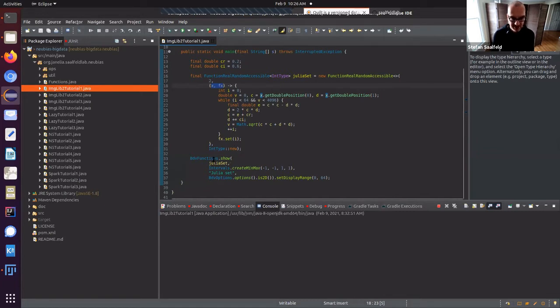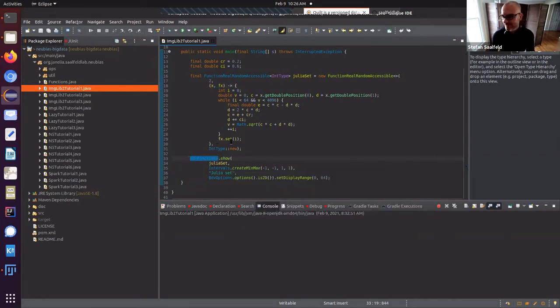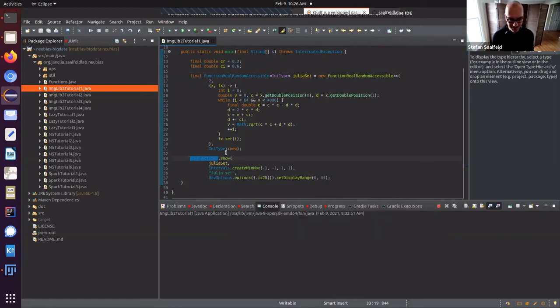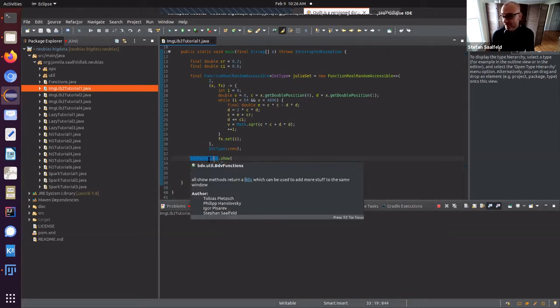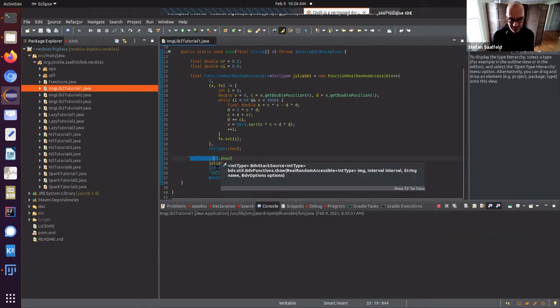This is the function, that's great. And now we're using the Big Data Viewer, which is a project spearheaded by Tobias Pietzsch, also at the Tomancak lab, alumni or still present, so that is a collaborator at least. And this has a lot of convenience functions. The most important convenience function is that you can display everything ImgLib2 with it very quickly by just using this BDV functions, static function collection.